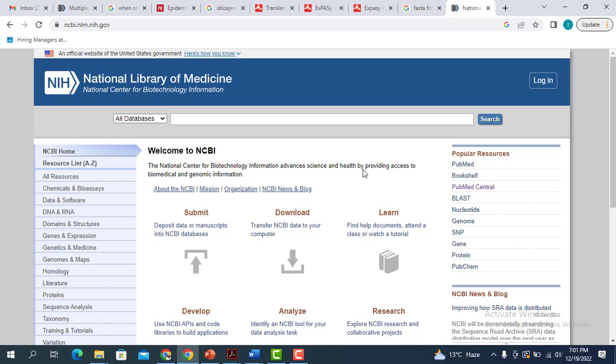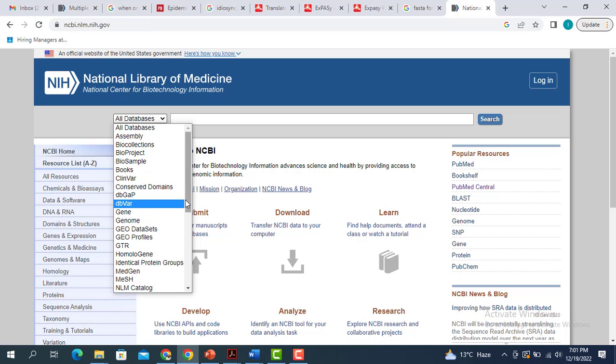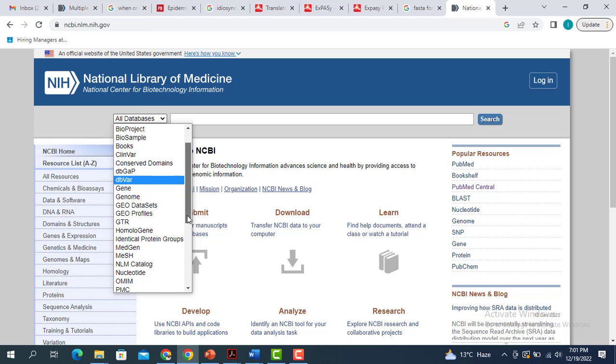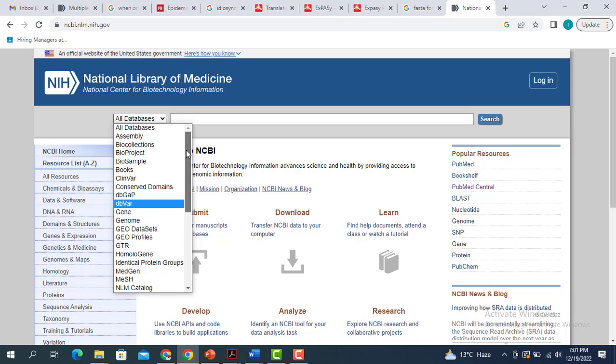As we are interested in retrieving the FASTA sequence of a nucleotide or of a gene, that means we have to select from all databases the gene part. Let me scroll down. We have to select the gene part. Here is the gene.